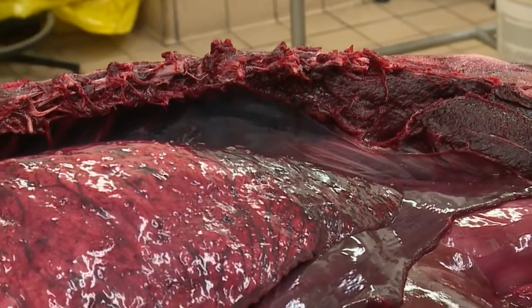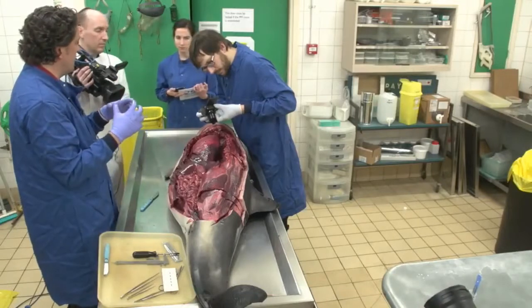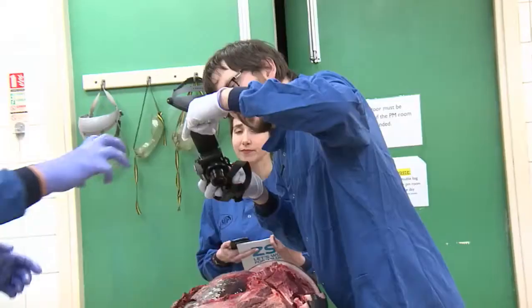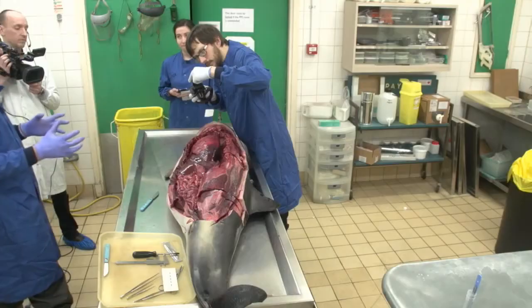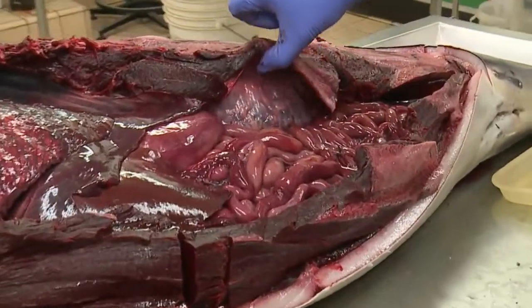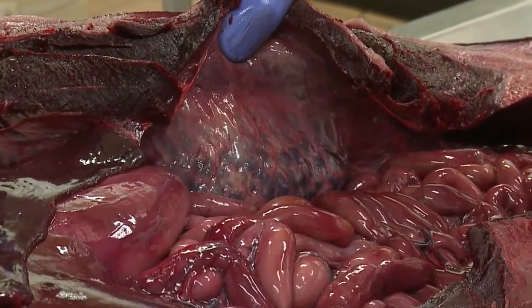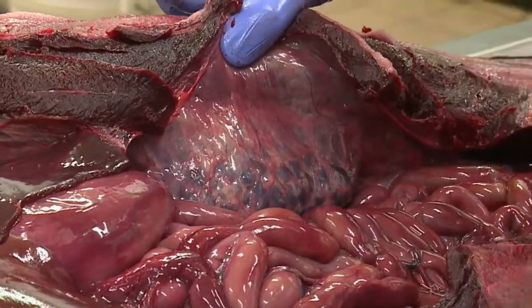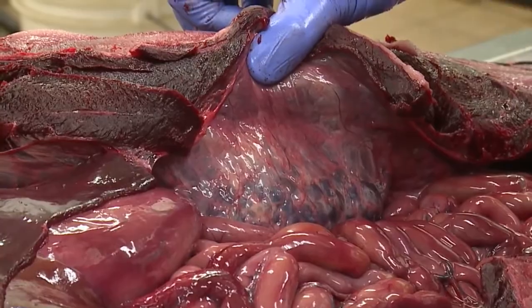So as they're going through the agonal process of death, they're thrashing around in the gear trying to escape. Not a very pleasant way to die, unfortunately. And then we get this rupture of the blood vessels in the roof of the back here. That's something we do commonly see. The other thing that's interesting to note is here around the kidney, it looks like we've got some fat running through the kidney. And that perirenal fat is something you only ever see in healthy animals. So again, we're building up this picture of a healthy animal that's died acutely in fishing gear.